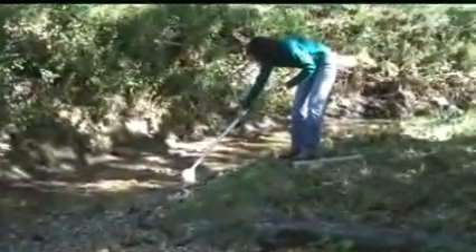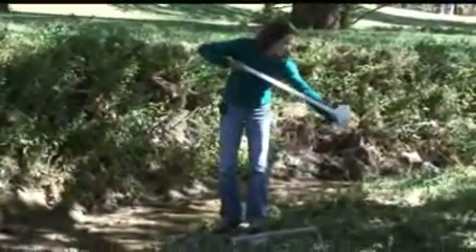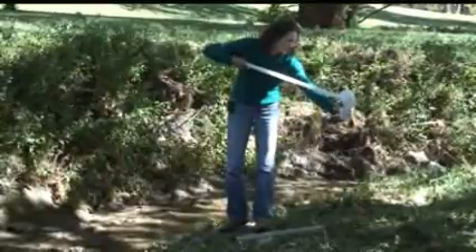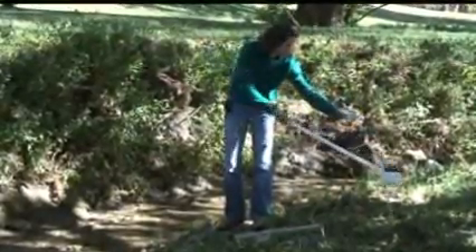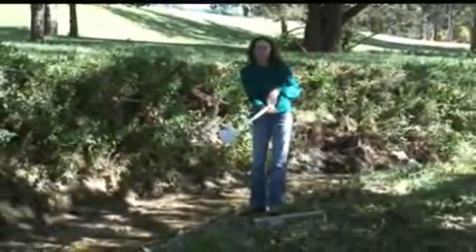It turns out it doesn't really matter too much which part of the stream you're collecting your sample from. Your results won't vary too much from close to the bank versus out in the middle of the stream.